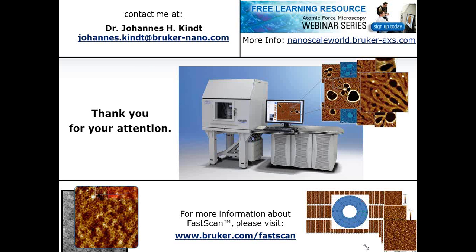So, Johannes, there are a number of questions on moving through the presentation from the beginning on ScanAssist, particularly what happens with the Smart Engage, and will this work on samples of different Z heights? So could you talk about that, and also just review how ScanAssist works? Okay.